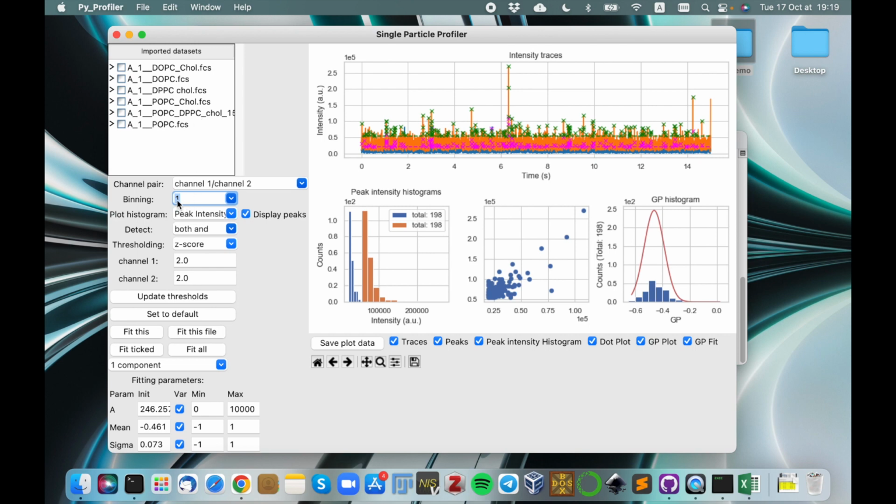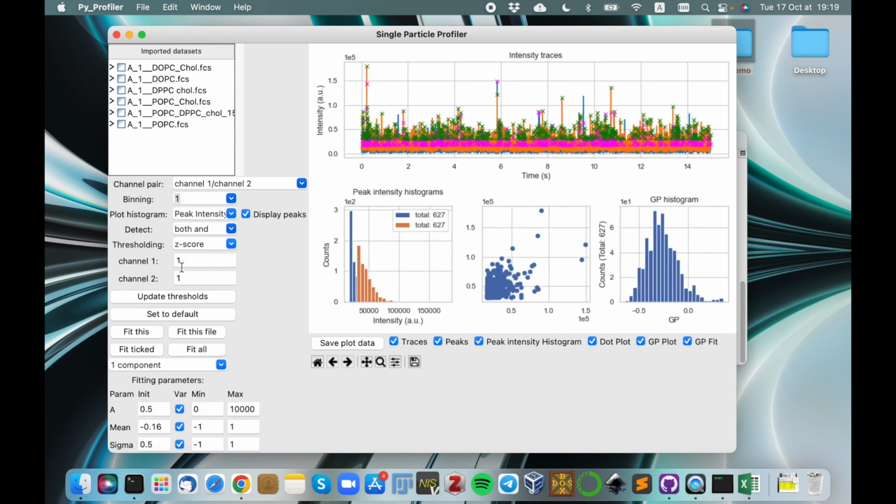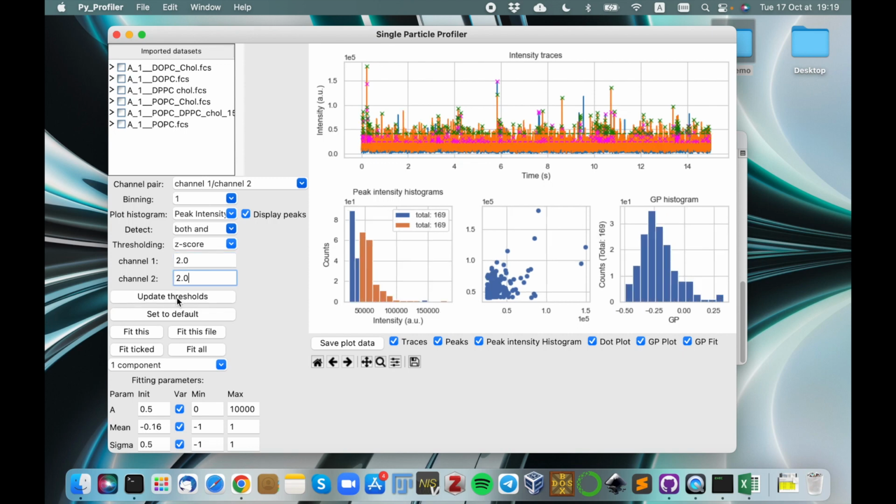But what I want to do is fit all of them with the same threshold and the same number of repetitions. So right now I'm here, and now I will go through to apply the same threshold everywhere, so the data will be nicely comparable.